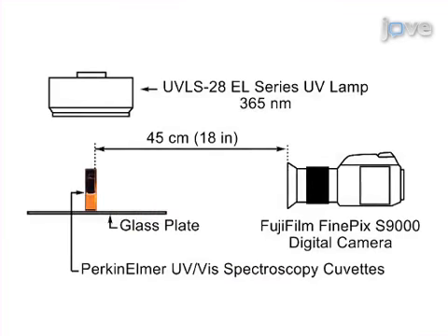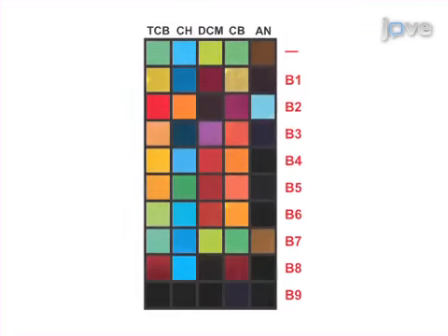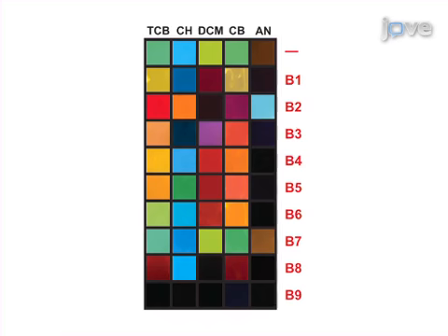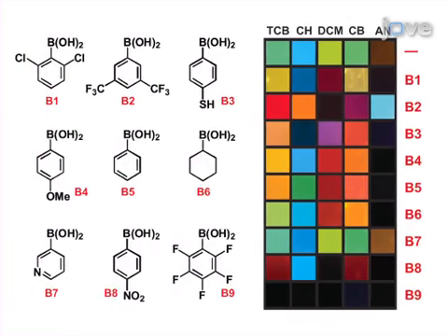Next, the combined sensor-analyte solutions are irradiated under 365nm ultraviolet light, causing them to emit light in the visible region. These emission colors are photographed using a standard digital photography setup. The final step is the generation of emission color panels, which are used to detect qualitative differences in emission of different analyte solutions.